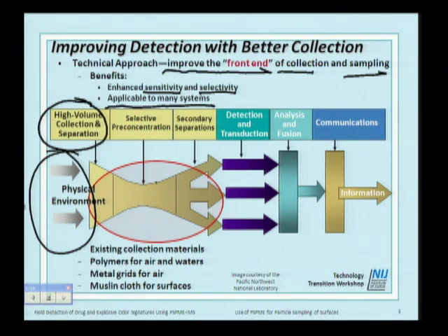Then what we do is SPME is selective pre-concentration. We're going to concentrate those odors that are going to be important for us to detect. Particle swabbing is similar to that. The instrumentation, IMS, provides a separation. So we'll get peaks at different migration times that will separate the components so that we can then detect them.